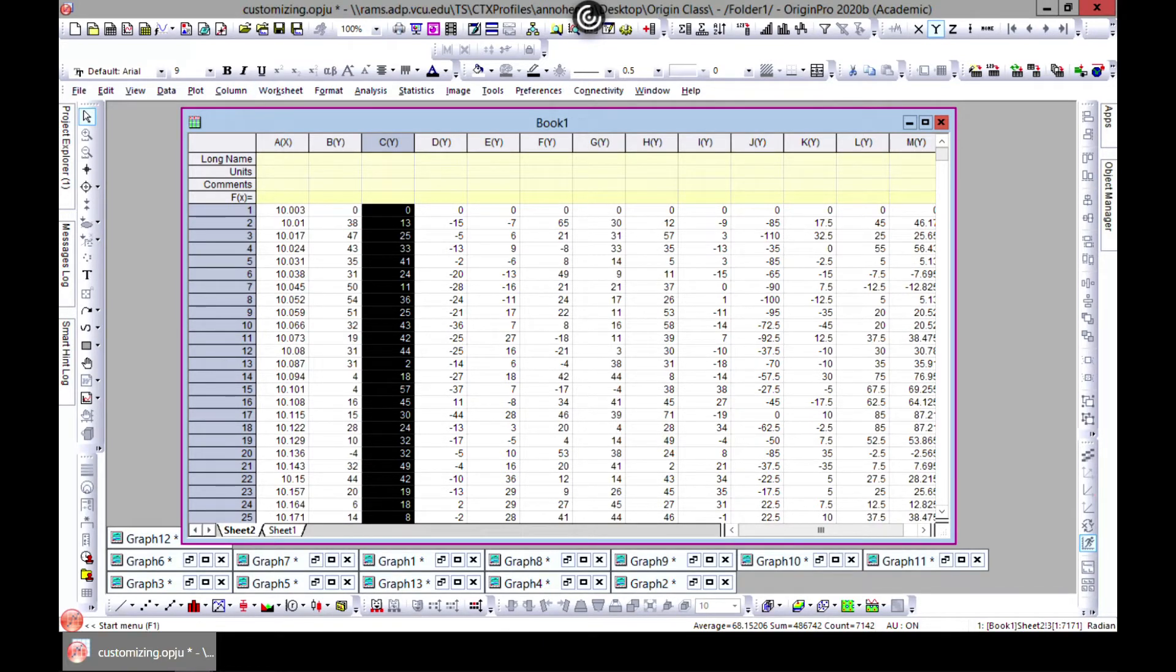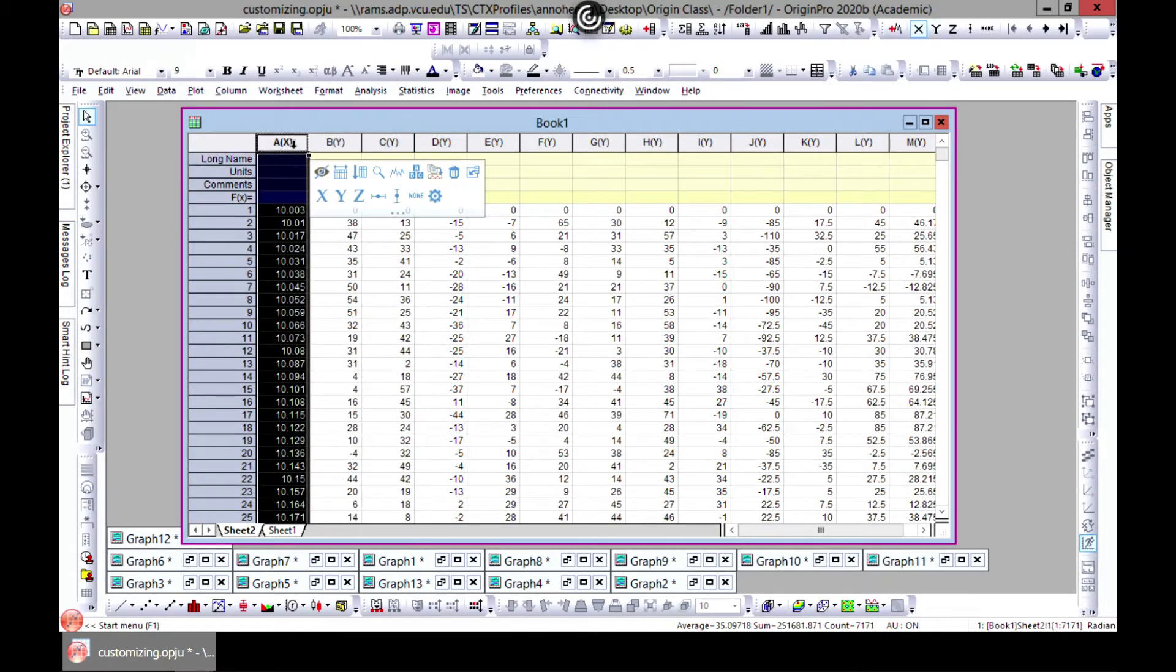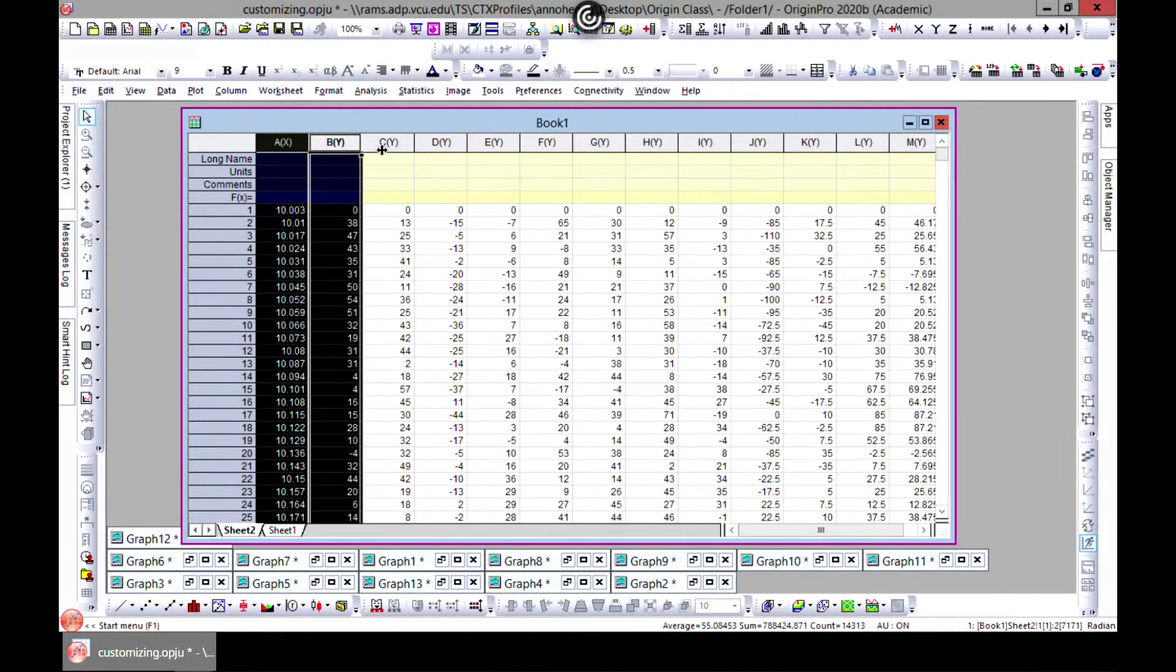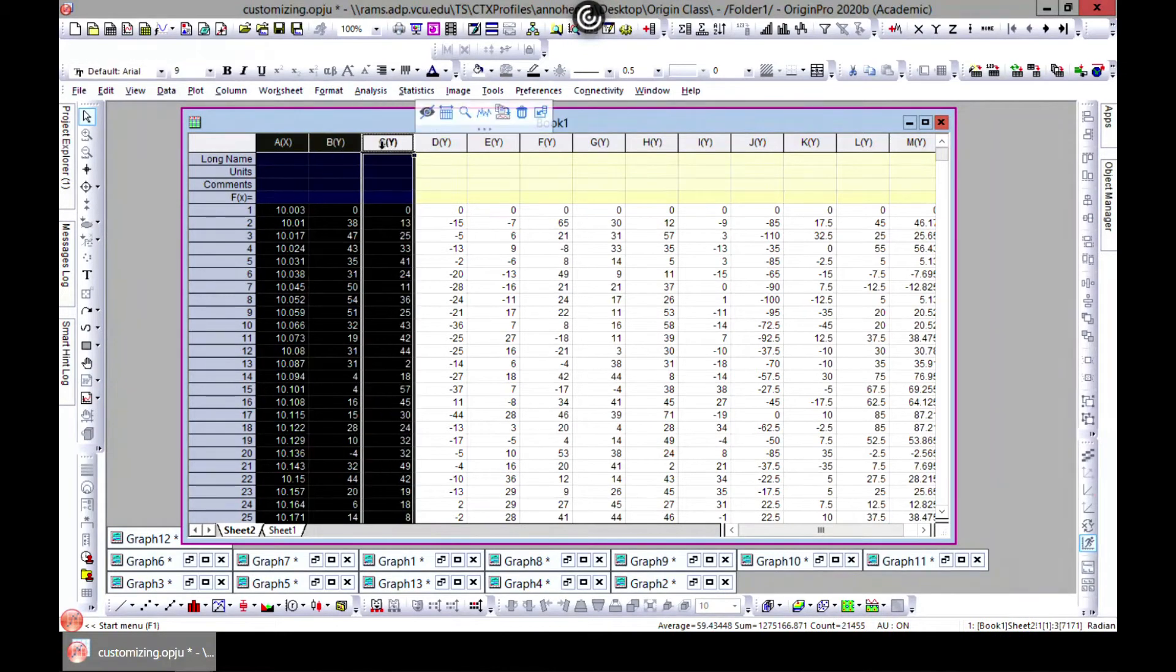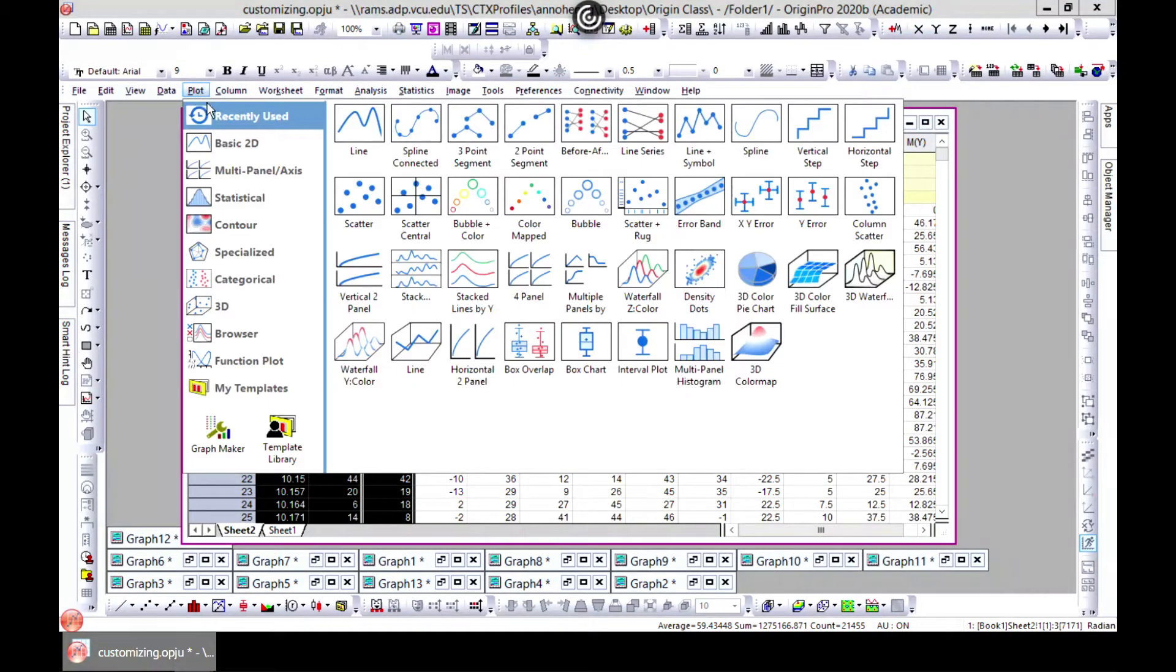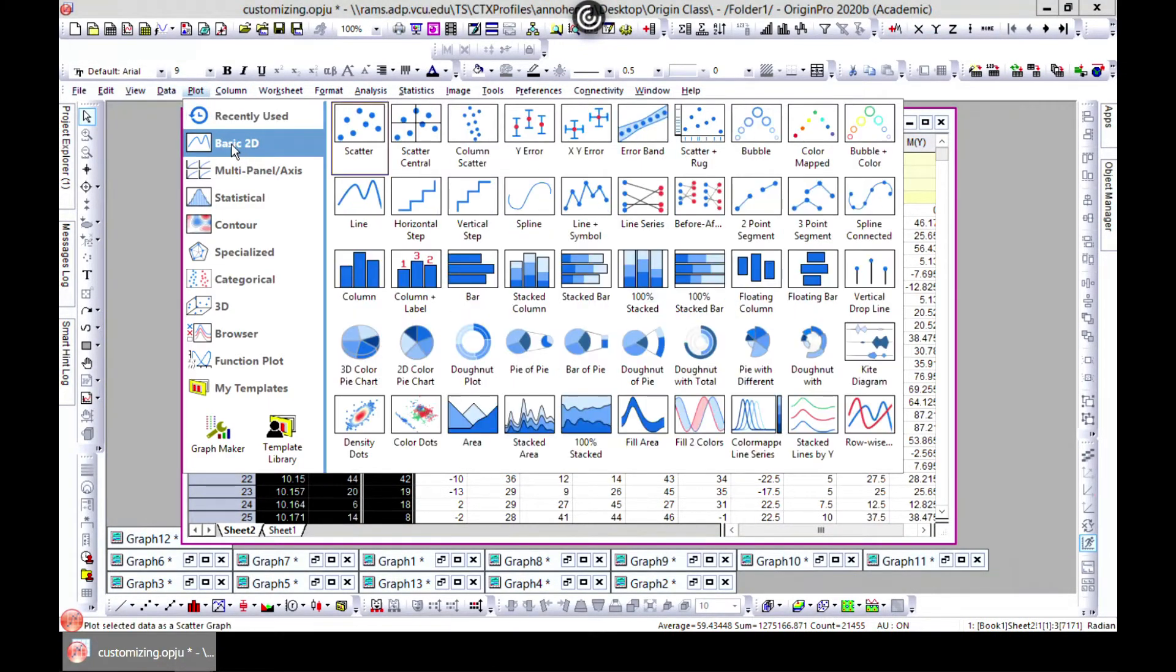Note we have it in a customized file that we saved together. Select the first three columns and then plot, and then come to Basic 2D and choose Line.